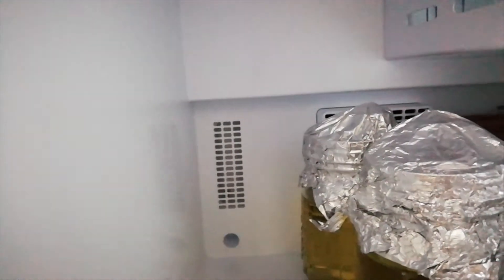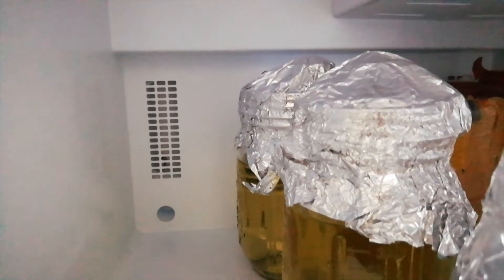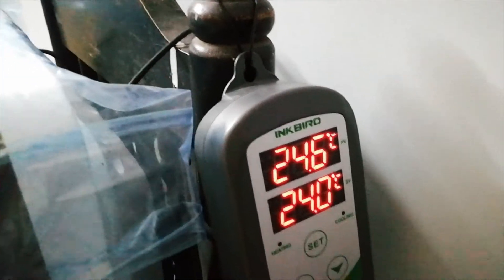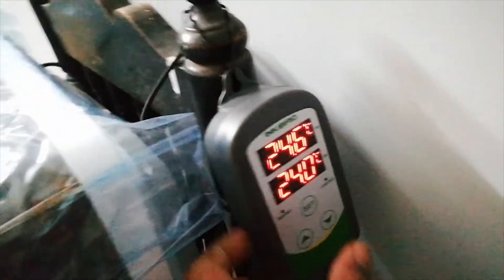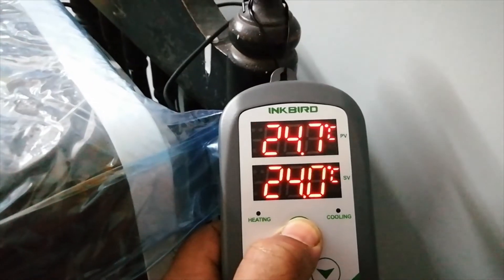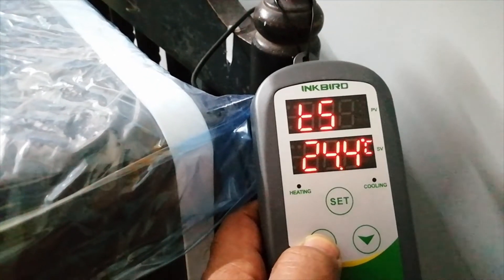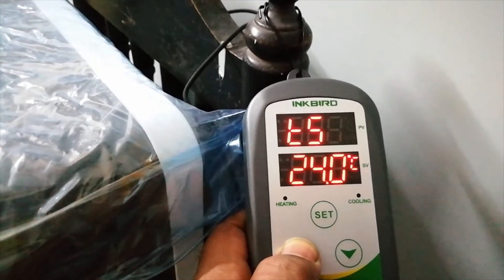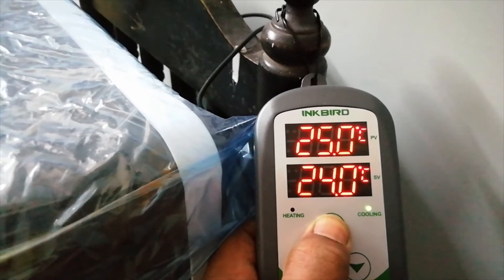This temperature sensor shows the actual values on the display. Right now it is showing 24.6 degrees inside, and I have set the target to 24 degrees outside. To set the temperature, you hold the set button for three seconds, then you can increase or decrease the value as needed. For my petri dishes, 24 degrees is sufficient. Once set, hold the set button again to confirm.